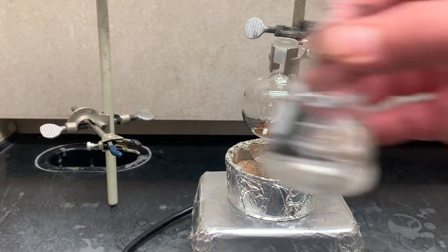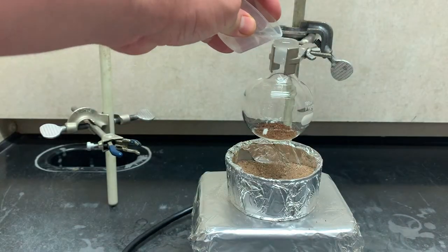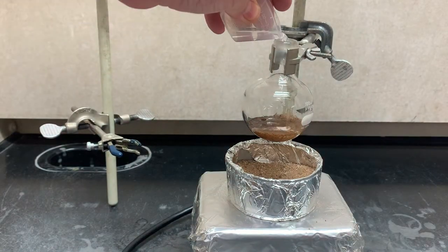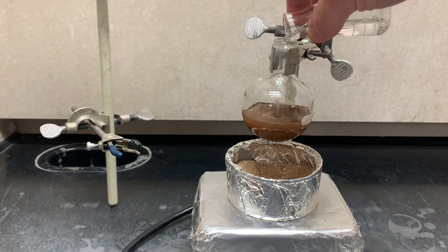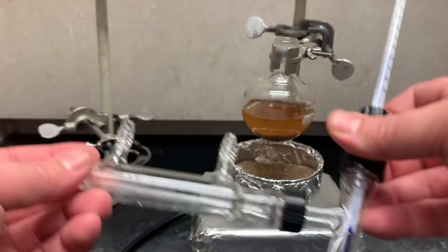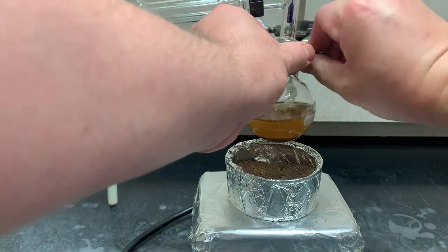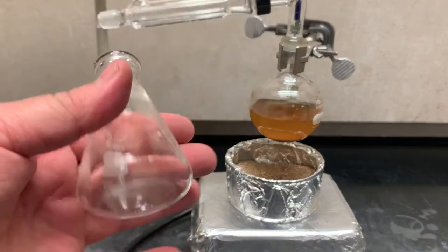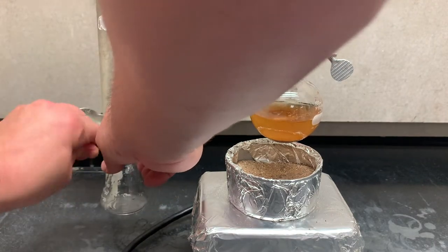And just about 50 mils worth of water. We will rinse whatever is left in there first. Might as well get it all. Now we can take our nice pre-made setup here. Just slip that on, make sure everything's nice and tight. And take our collection flask and place that right there.